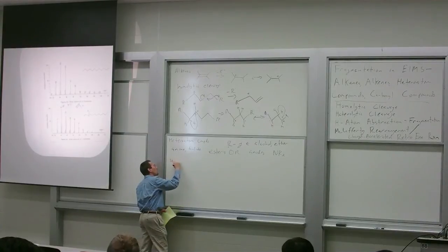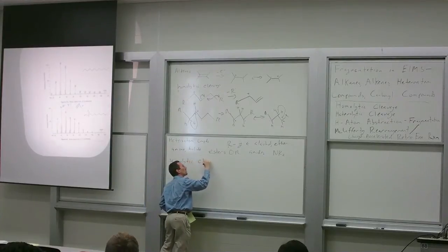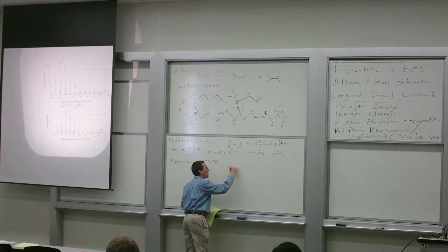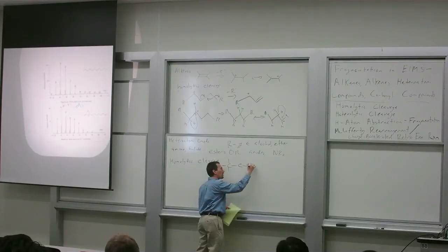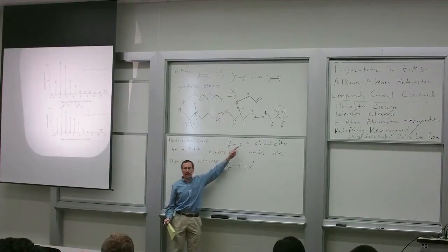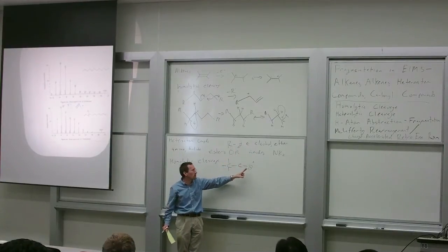All right, so pathways that can occur. Homolytic cleavage. Homolytic cleavage is just a radical cleavage mechanism, the same that we saw before. If here's our group that's one over from your heteroatom, we kick our odd electron out of the highest occupied orbital in the molecule, the n orbital, the lone pair on the heteroatom. That's a good resonance structure to start with.